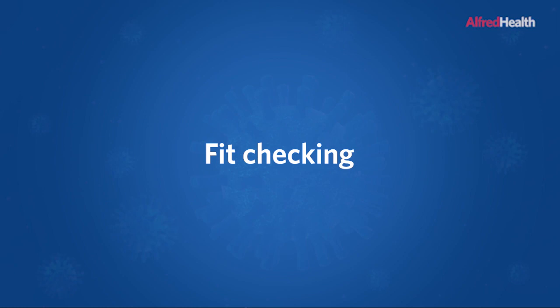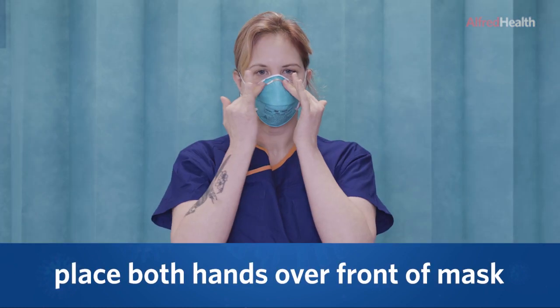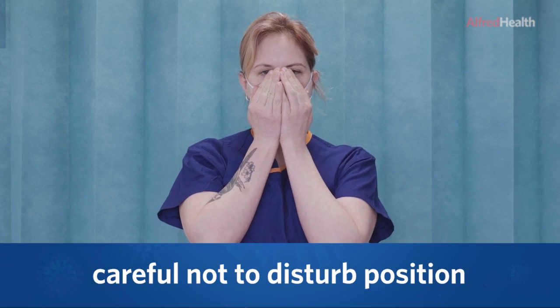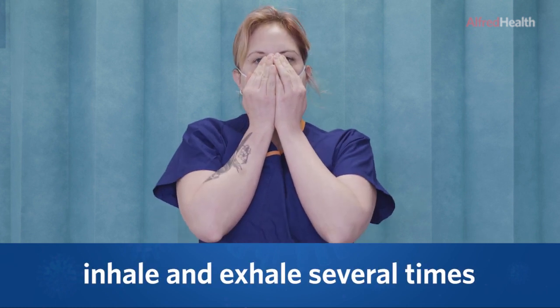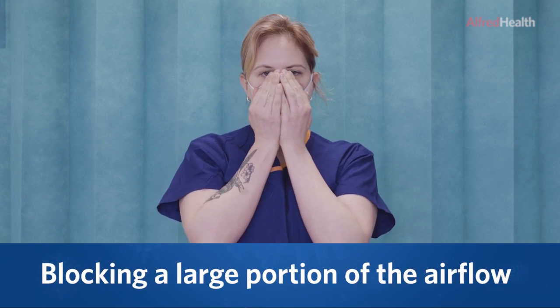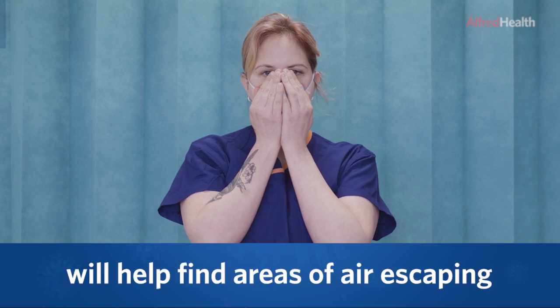To fit check: place both hands over the front of the mask, being careful not to disturb the position, and inhale and exhale several times. By blocking a large portion of the paths for air to exit the mask, this will help you to find if there are any areas of air escaping.